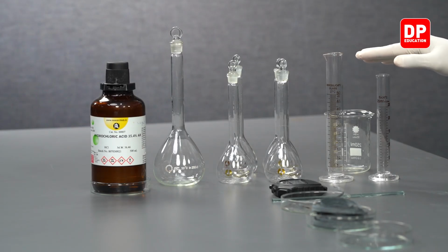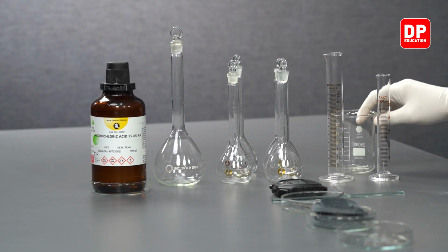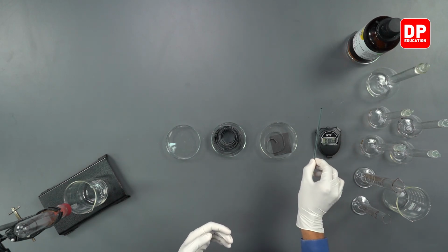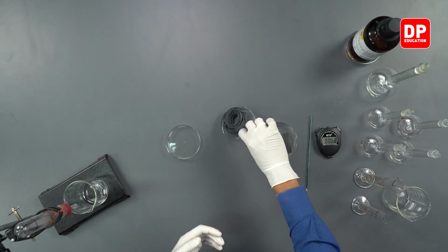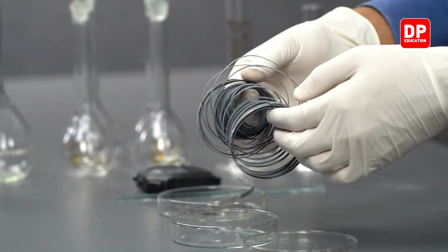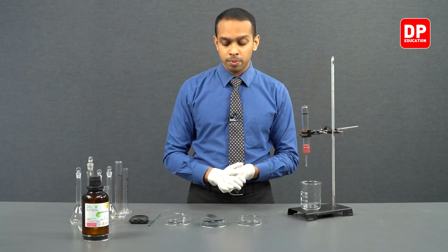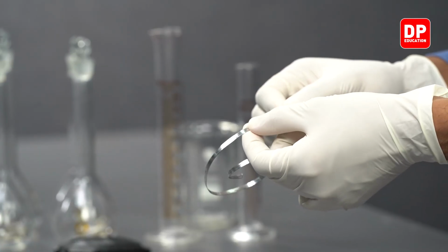Apart from that, we will be using measuring cylinders, beakers, a stopwatch, a stirring rod, magnesium strips. As you can see, students, the magnesium strips that we have here are coated with, or it has a gray color outer coating. So before we use the magnesium strip, we have to strip off this oxide layer or the coating that you have on the magnesium strip.